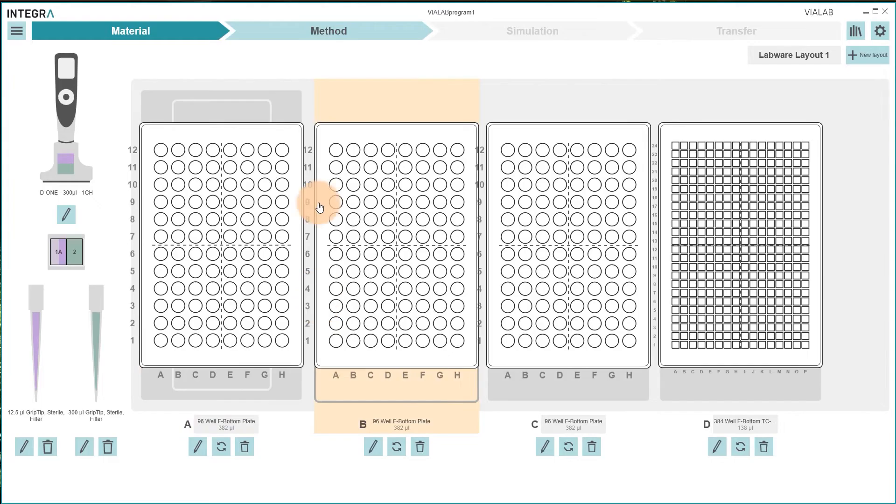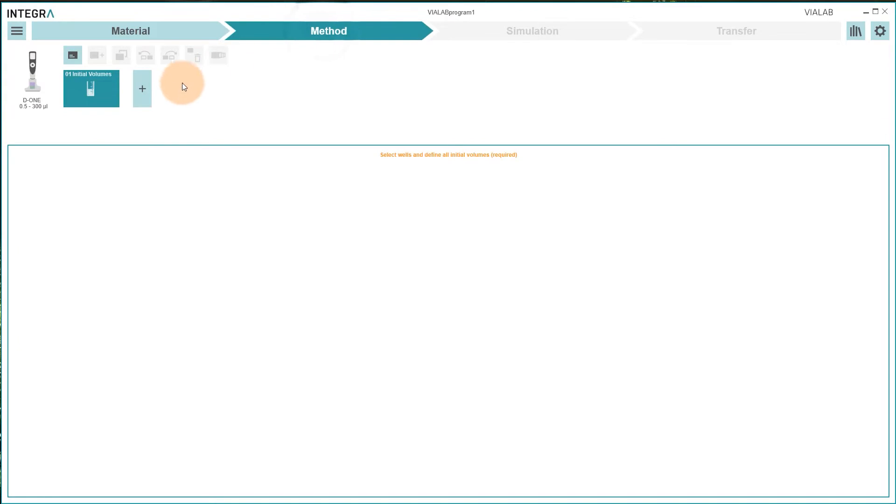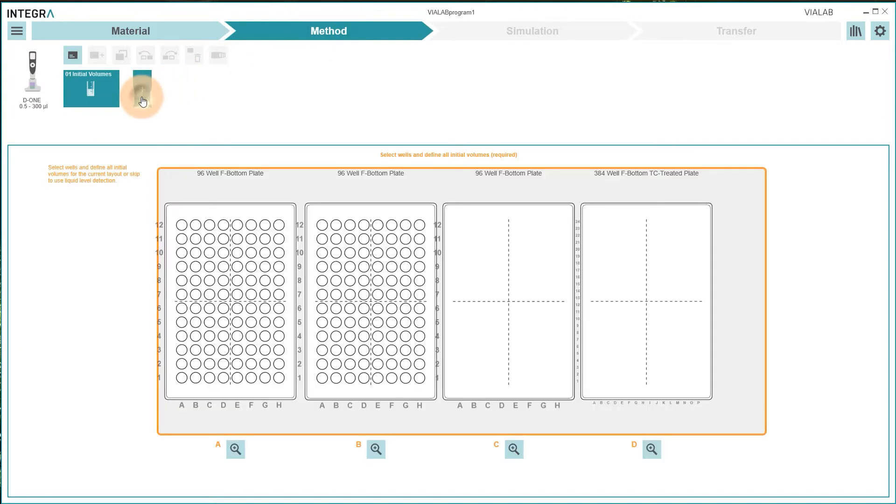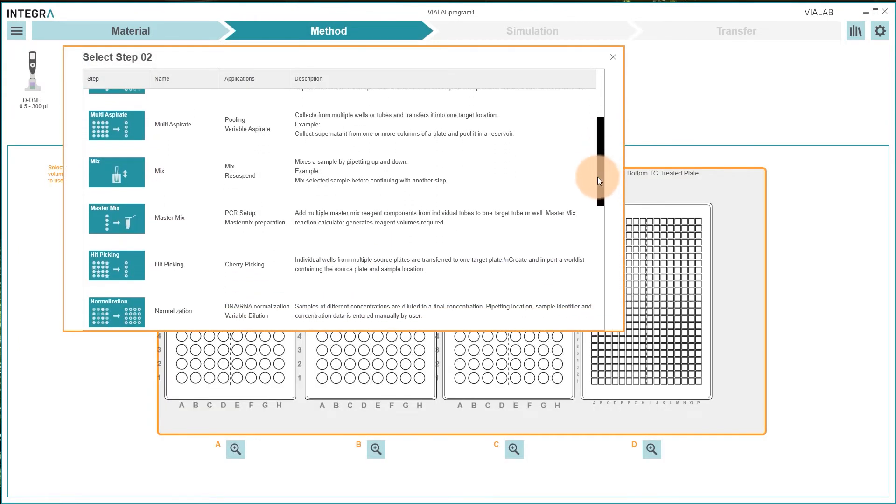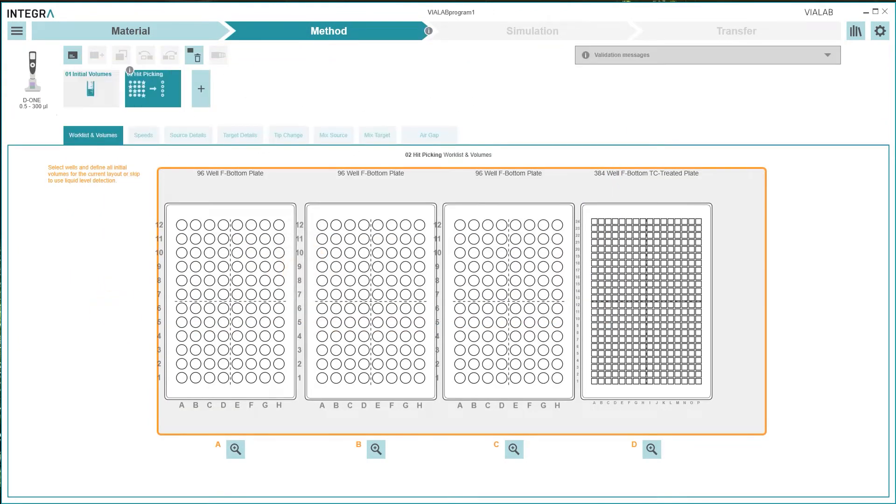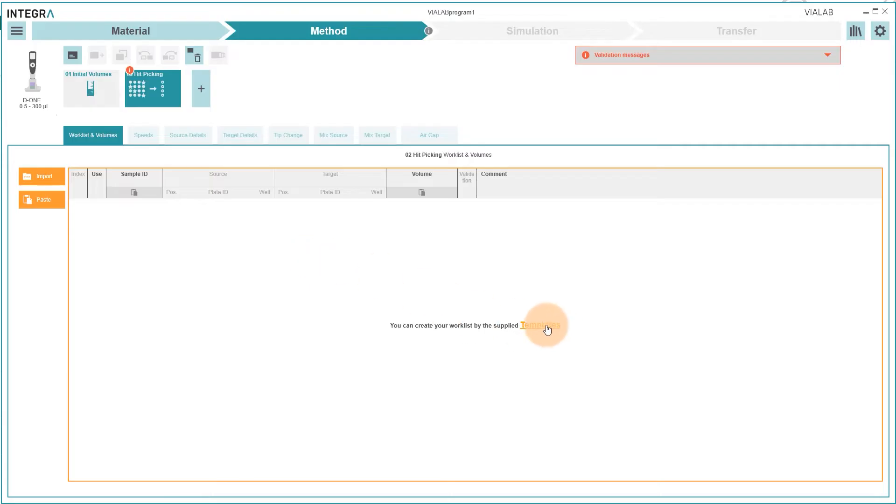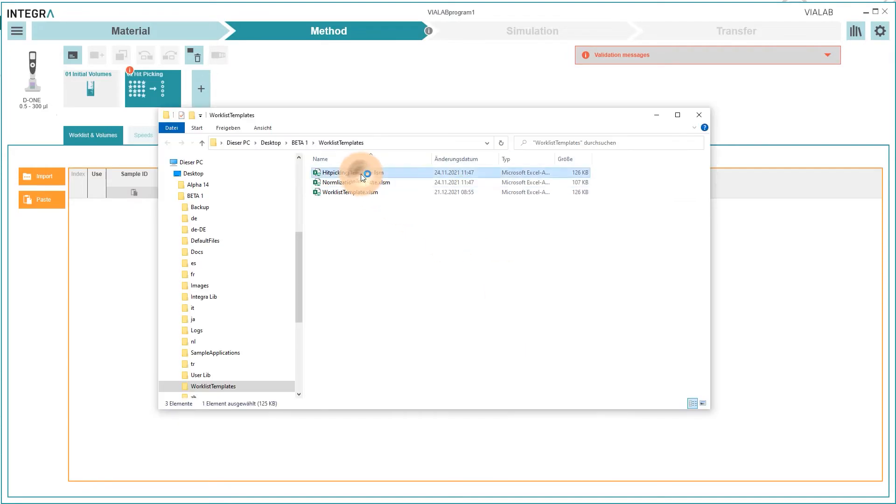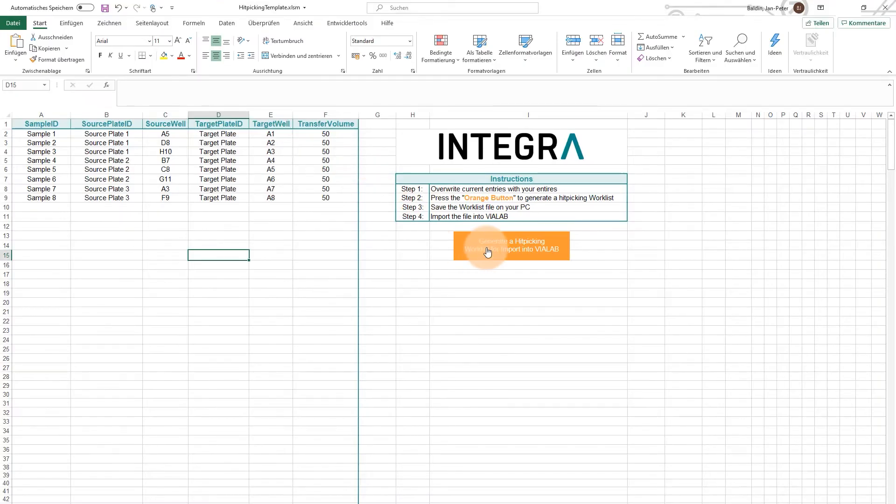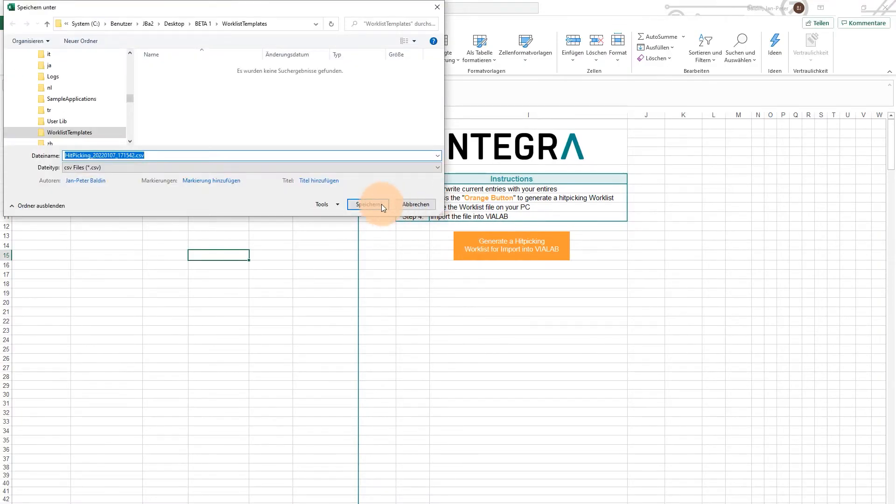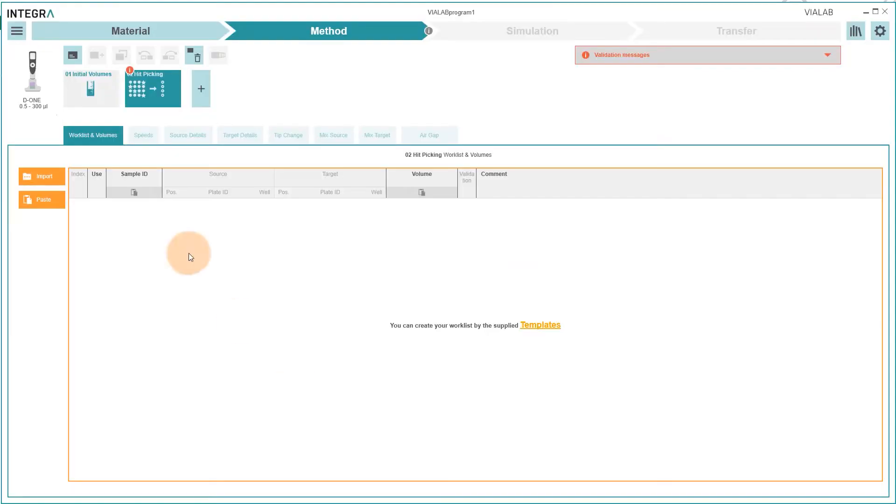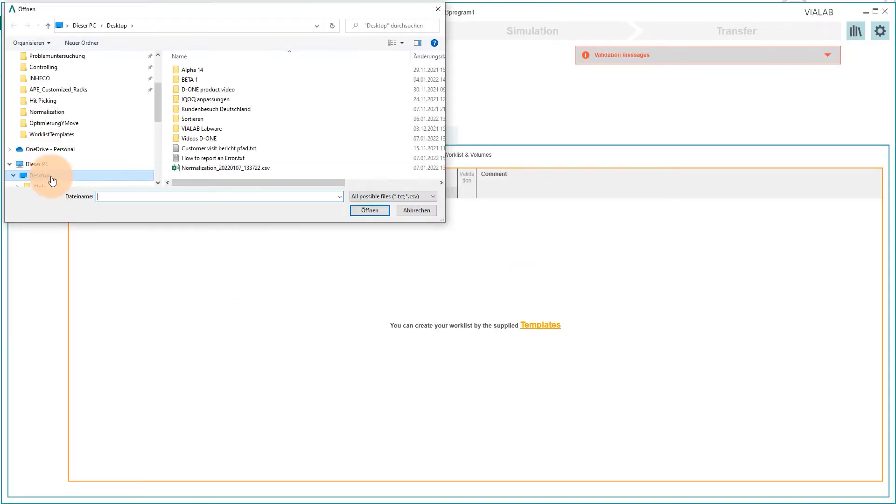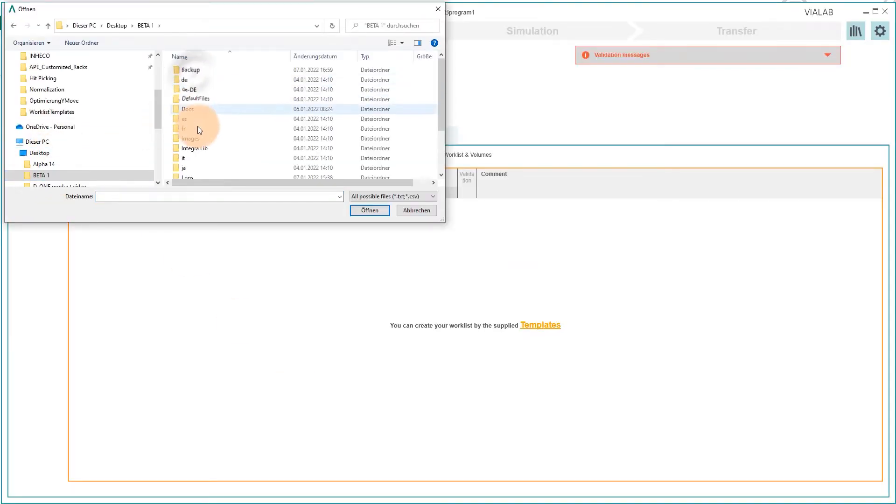Go to method and add new step. Scroll down and select the hit picking step. Make sure you create a worklist based on Integra's templates. Fill in your data, save the worklist file and import it into Violab.